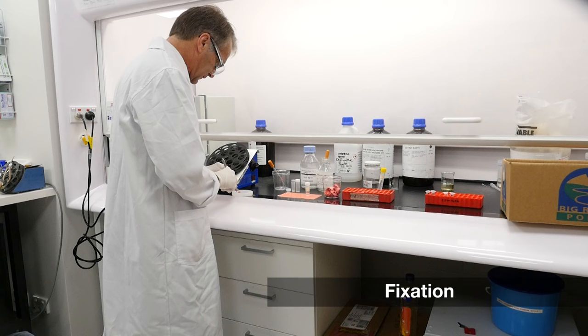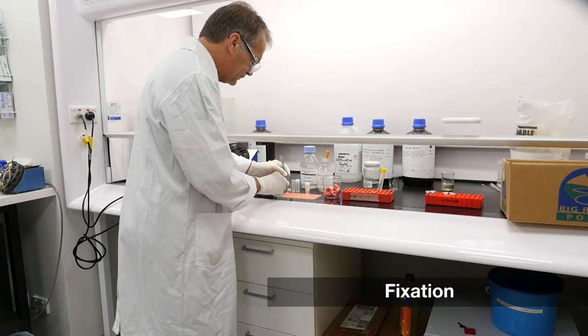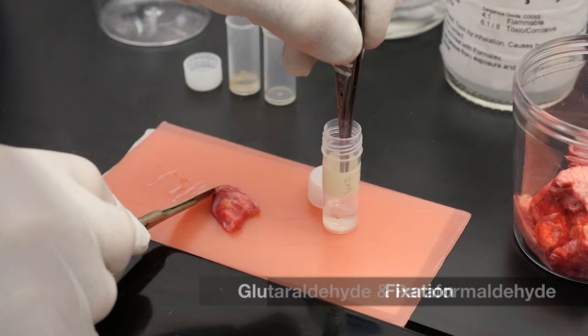Fixation is the first step in tissue preparation. It stabilizes the cellular organization. Cellular structure is best preserved if fixation occurs as close as possible to cell death. Tissue samples are cut into small pieces of about a cubic millimeter, before being immersed in a fixative solution.